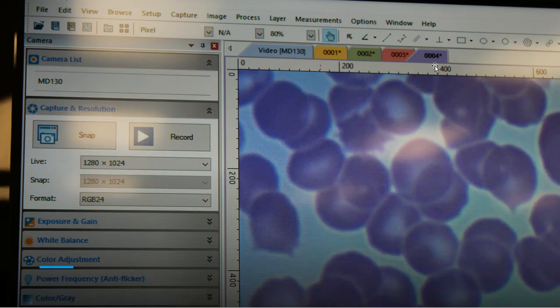But please keep in mind, I think it is better for me, at least, if I put more organization to this whole madness that's getting ready to happen. So I like to take the pictures first and then immediately save them after the fact. I don't like that toolbar to get so busy that I forget what goes where. So I tend to clean those up a little bit, and to clean those up, you go File and then Close at the very bottom.